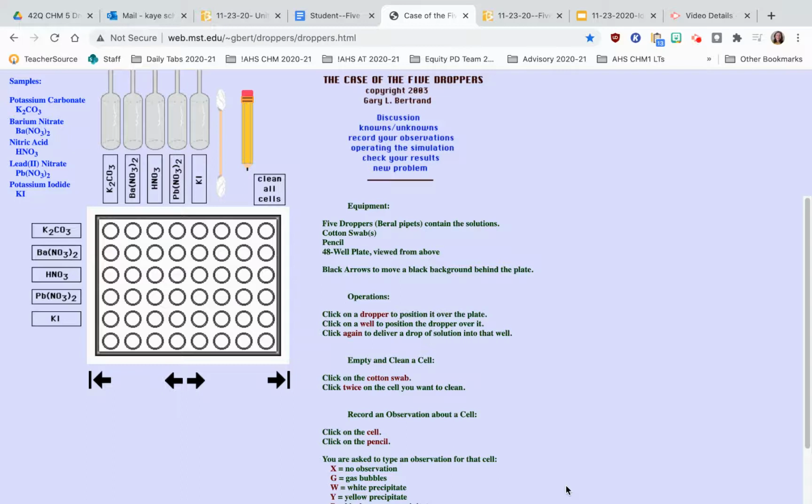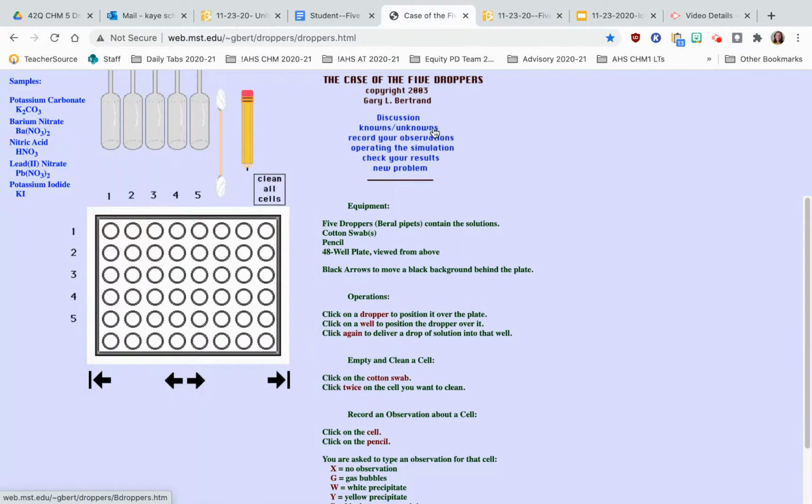Hi, this is Mrs. Schmidt, and this video demonstrates how to collect your data. I want to reiterate again that once you start collecting your data, it's important that you collect the data and observations for the knowns and the unknowns.